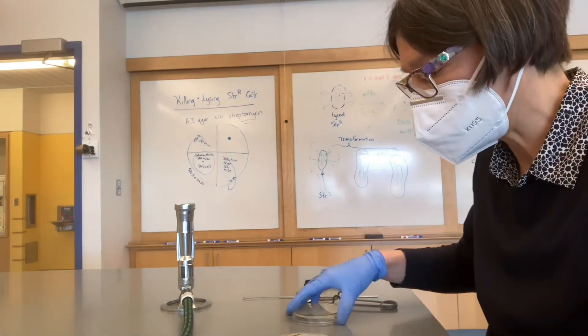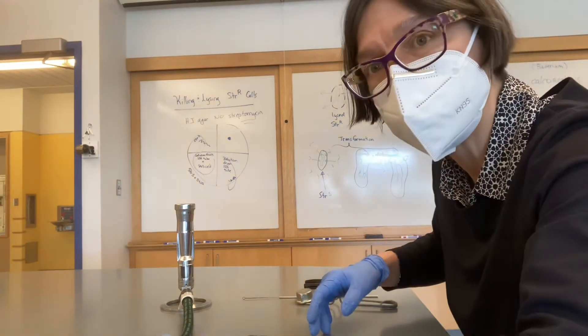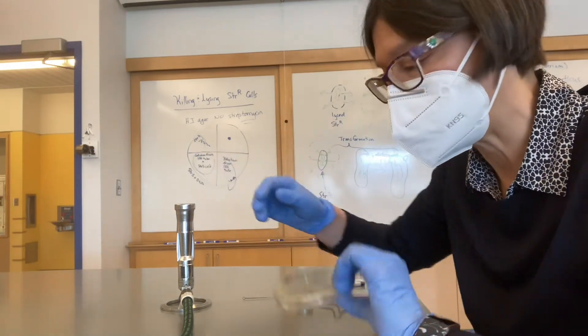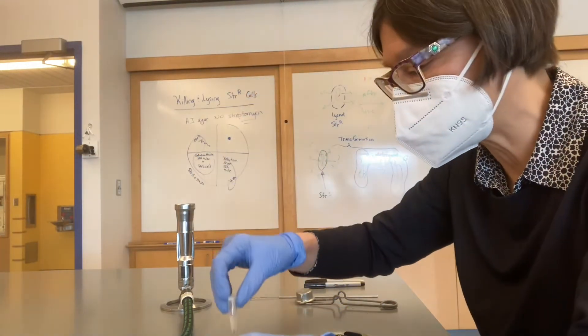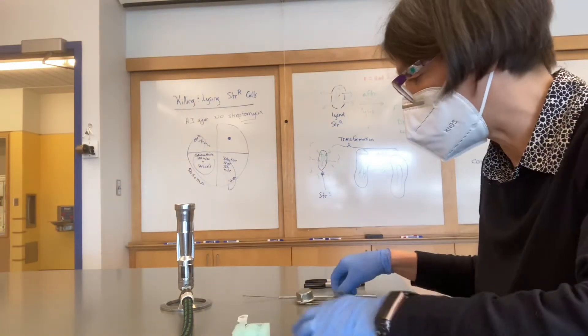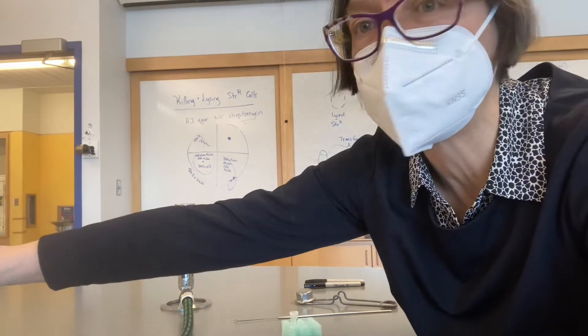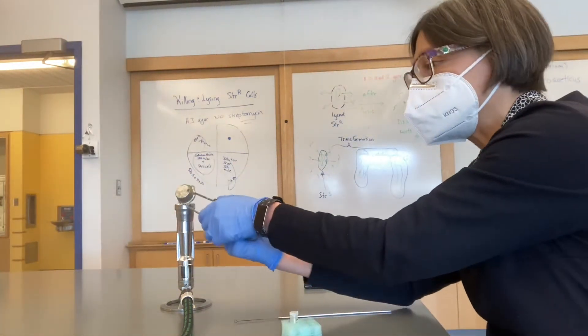So I'm going to start the lab by taking the culture of STRR, the AAD2 containing strain, taking the SDS tube, getting those in front of me, and I'm going to turn the Bunsen burner on. I'm turning the gas on, and I'm striking the burner.